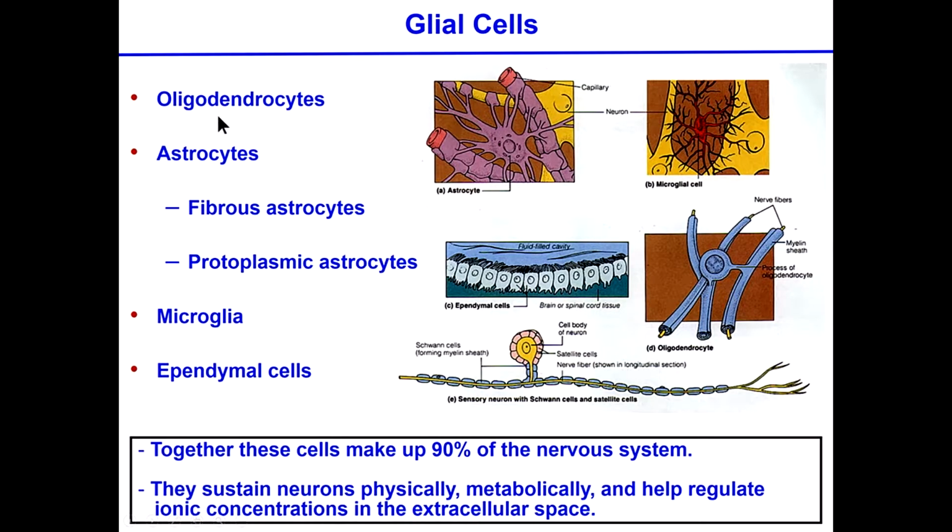The oligodendrocytes are very similar, and I already said that several times, to the Schwann cells. They're very plastic, and they can roll around the axons and form the equivalent of the myelin in the central nervous system. They can actually wrap, and this is an example in this portion of the picture. One oligodendrocyte can wrap more than one axon and maintain the structure together. So these two axons are within the same proximal space.